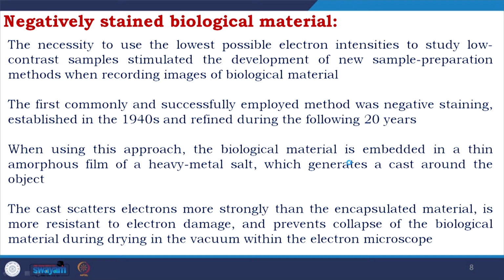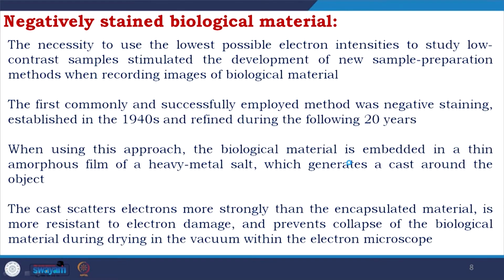So, negative staining of biological material plays a very important role even today in sample preparation, checking the sample, and initial development of the 2D model. The necessity to use the lowest possible electron intensities to study low contrast samples stimulated the development of new sample preparation methods when recording images of biological materials.